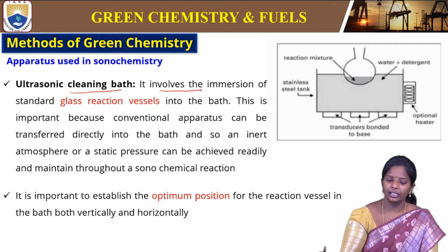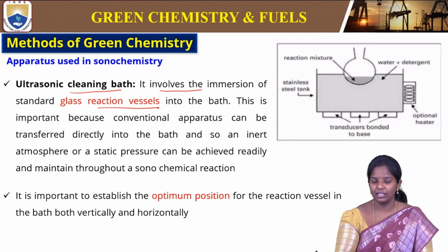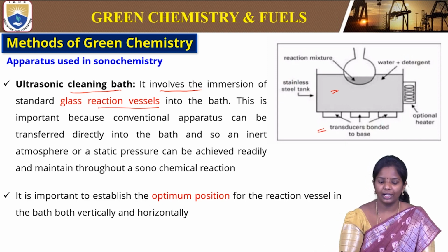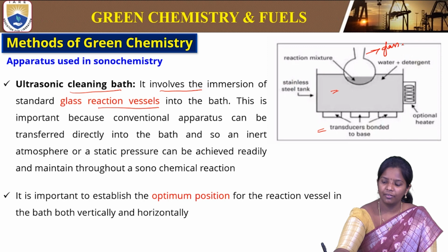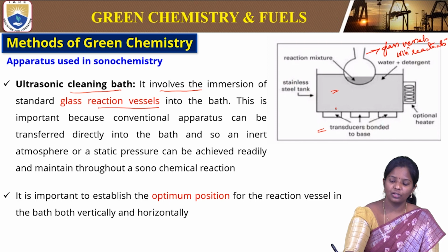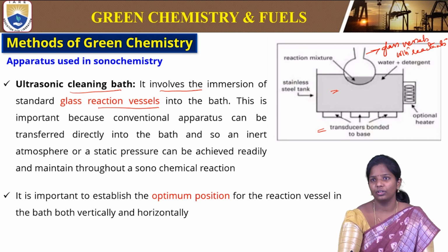So it involves the immersion of standard glass reaction vessels into the bath. It has water plus detergent that can be used. These are the transducers that are used for creating vibrations. That will produce vibrations, and this is the glass vessel with reactants, for example. If they are immersed into the water, the vibration will help in mixing, and also the synthesis will force the reactants to react together.